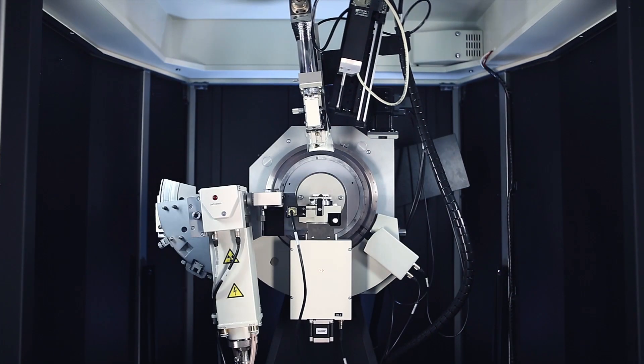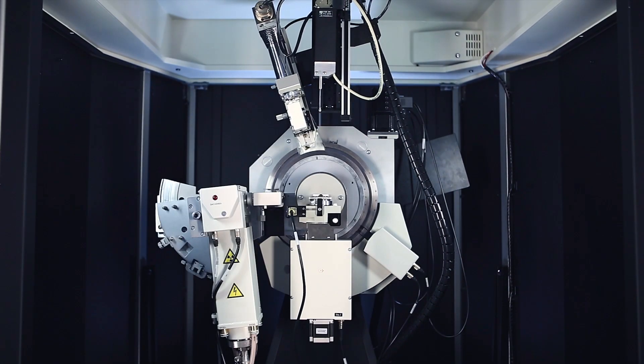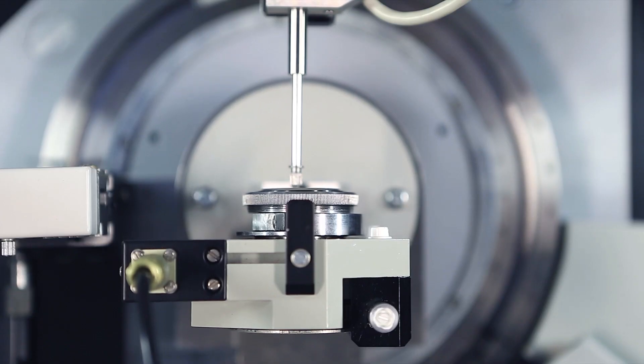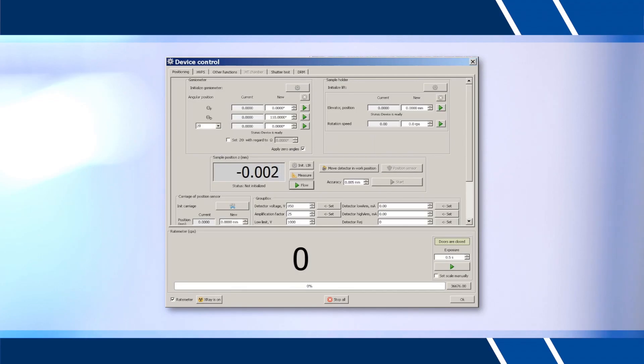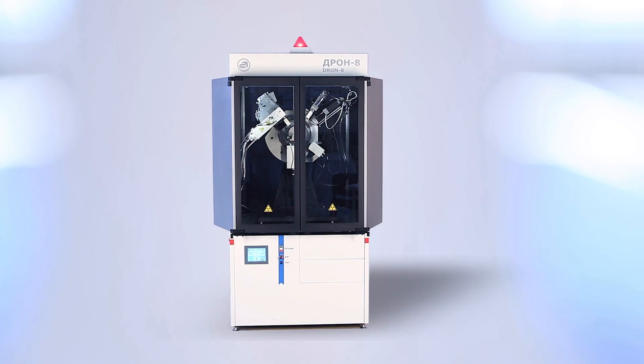The system for automatic alignment of sample plane enables easy installation of samples with different thicknesses. Safe operation is ensured by remote control of beam shutter and by protective cabinet with lead glass.